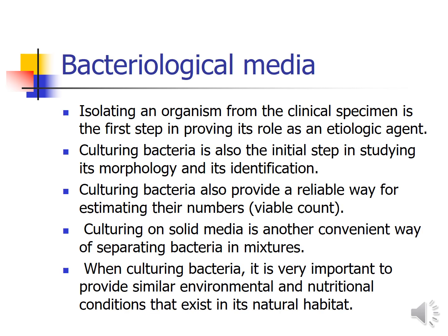Now we'll come to culture media. So first we'll talk about bacteriological media. The use of this media is to isolate the organism from clinical specimens, then culturing the bacteria, which is an initial step in studying morphology and identification. So the main purpose of this media is to isolate the bacterial pathogens from clinical samples, then culture it, identify, then go for antibiotic susceptibility testing and so on. Fine.